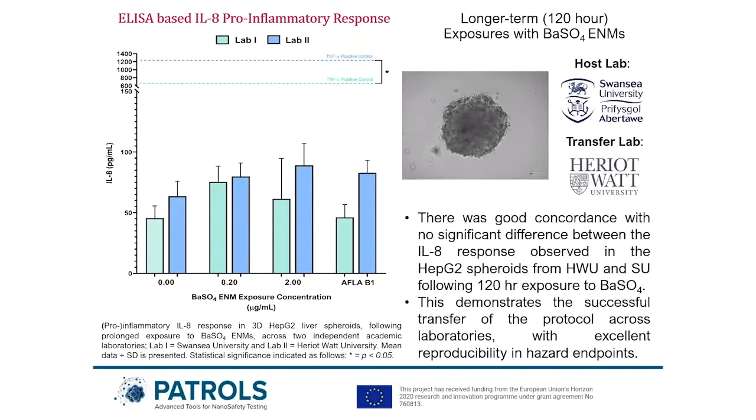For the interlab trial done within PATROLS itself, a longer-term 5-day exposure to barium sulfate nanomaterials was tested in both the host lab, Lab 1, Swansea, and the transfer lab, Lab 2, Heriot-Watt. The IL-8 pro-inflammatory response was assessed comparatively in this trial, following prolonged exposure to 0.2 and 2 micrograms per mL of barium sulfate nanomaterials.